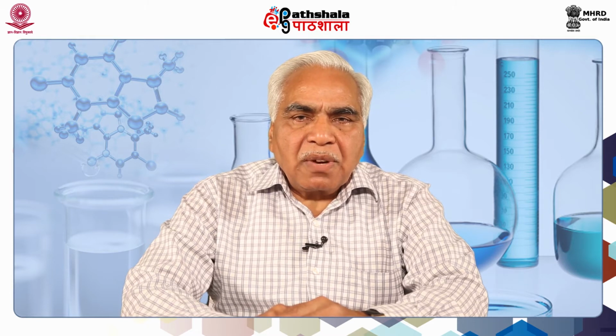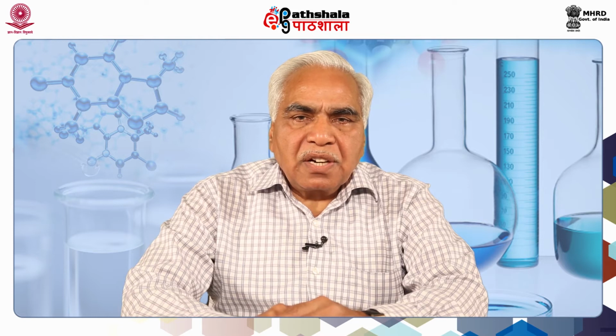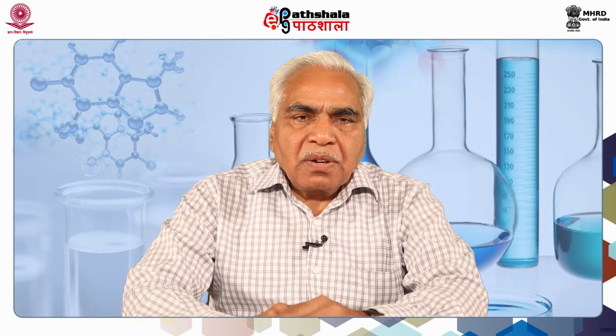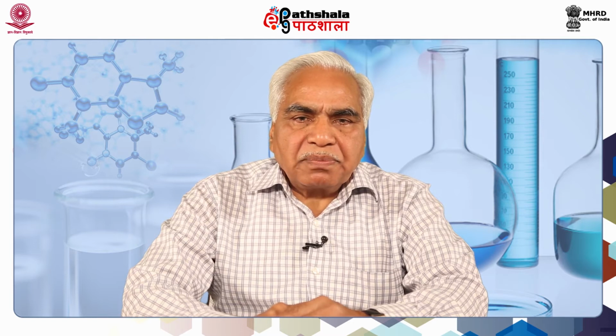This high resolution magnification is routinely used to generate high resolution images and to show spatial variations in chemical compositions. It is also widely used for precise measurement of very small features and objects below 50 nanometers in size.